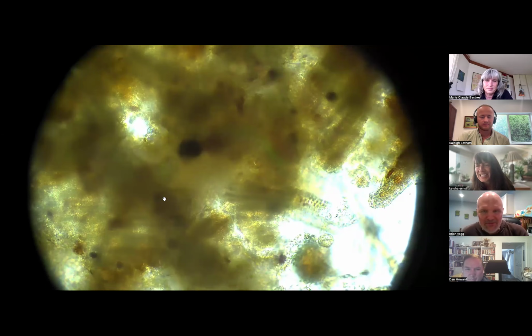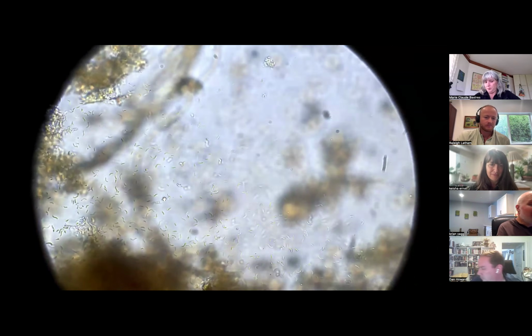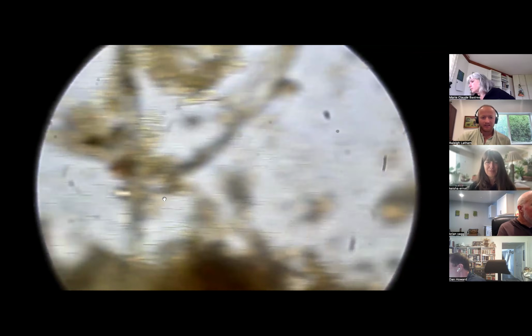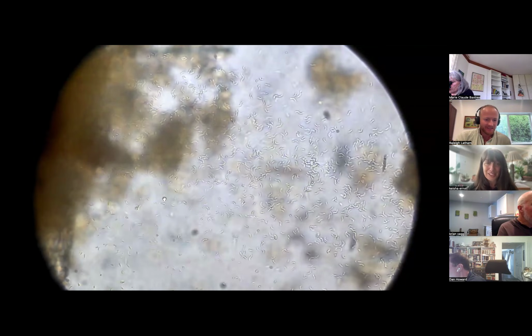Cool. Stacy asked about some that weren't moving. She mentioned those ones that weren't moving, and she's wondering if the oxygen's starting to get them. I don't know, to be honest, I'm not really sure. I think they're attaching to the bottom of the cover slip, because that's where my focal plane is at right now. So why they're not moving, I'm not really sure, to be honest with you. What fun it would be if the rotifers stuck to the surface. It'd be fun if the rotifers start colliding with the spirochete area. They're just gonna go to town there. This is where the adventure just gets fun.